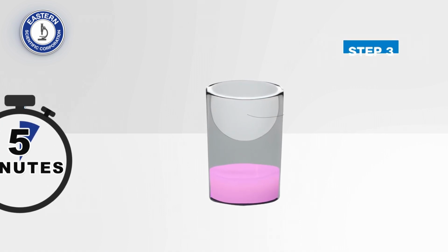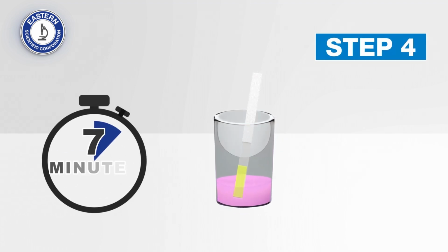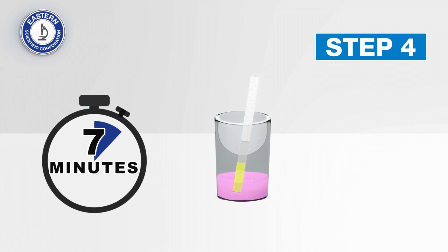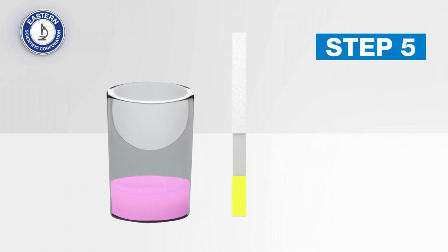Step 4. Insert the dipstick into the microwell after first incubation. Incubate another 7 minutes. Step 5. Take out the dipstick from the microwell and remove the sample pad at the lower end and interpret the result.